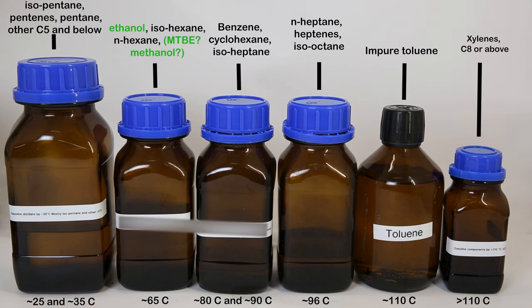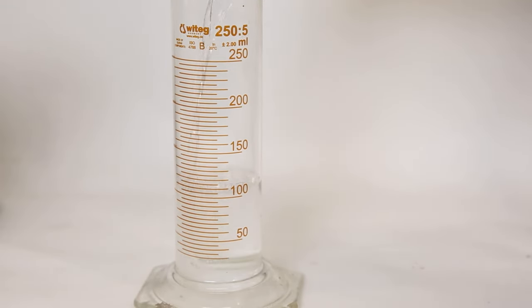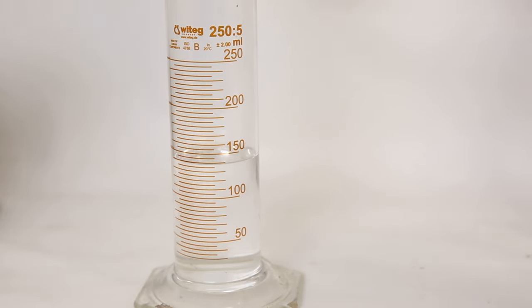But, the second fraction likely contains a lot of ethanol, and maybe some MTBE. So, I will wash it with water, and see how much of the content is actually hexanes. We can see that the total volume of the fraction before washing is 140 ml.